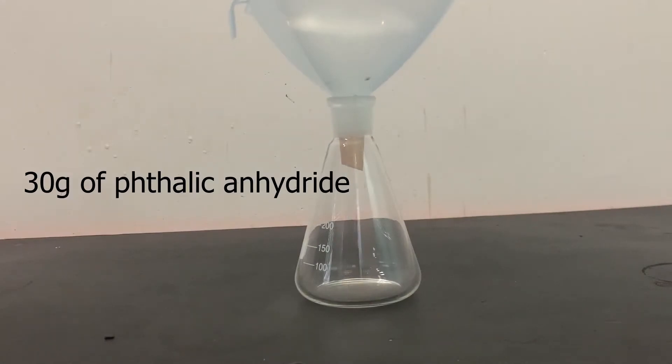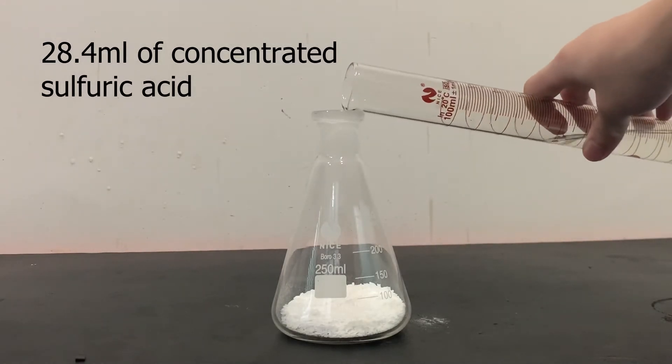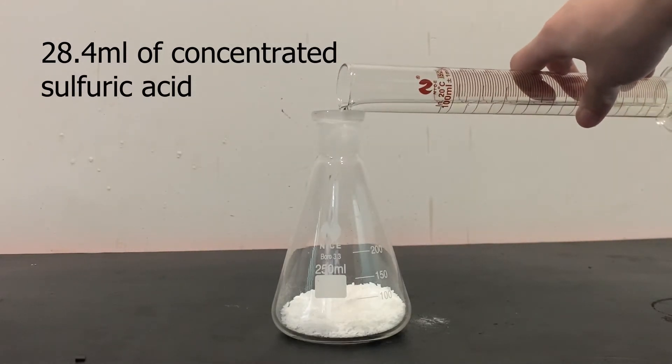To get started, I added 30 grams of phthalic anhydride to a 250 milliliter flask, which was then followed by 28.4 milliliters of concentrated sulfuric acid.